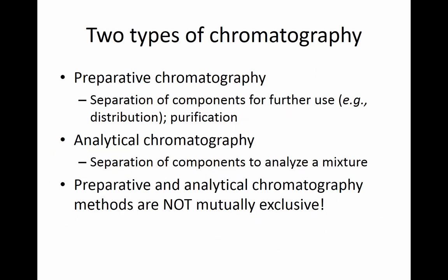And if we want to be general about it, there are two types of chromatography. There's preparative chromatography, which is essentially, we've been doing a lot of preparative experiments in lab. This would be separation of components for further use. So you're going to purify them further and then eventually distribute them and package them and whatever. So preparative chromatography is just getting your product ready to package and sell.